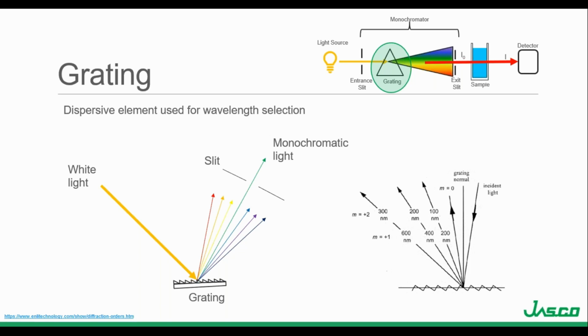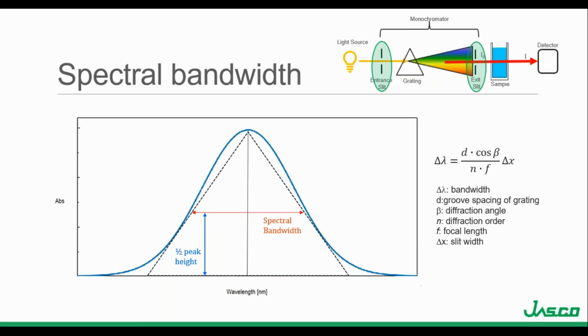So the light is then refocused by another mirror onto the exit slit, which is going to adjust to accommodate for the dispersive properties of different wavelengths. While the monochromator is set to a specific wavelength, the light emerging is not perfectly monochromatic, but contains a range of wavelengths. The total energy at the exit slit of the monochromator at a specific wavelength has the intensity distribution of an isosceles triangle.